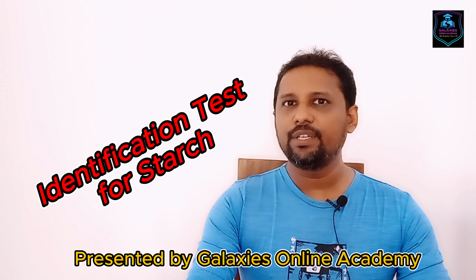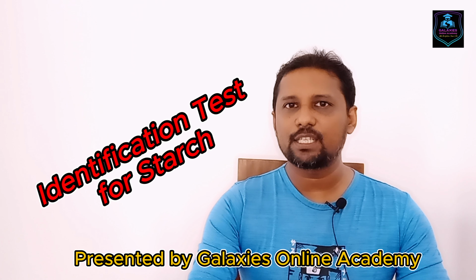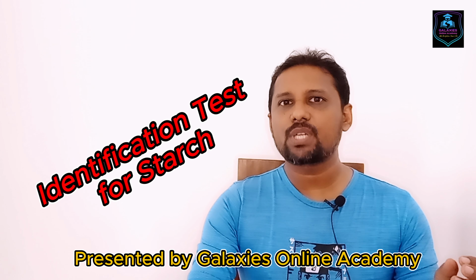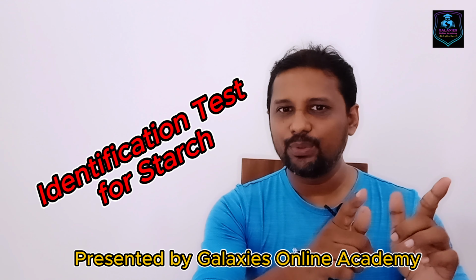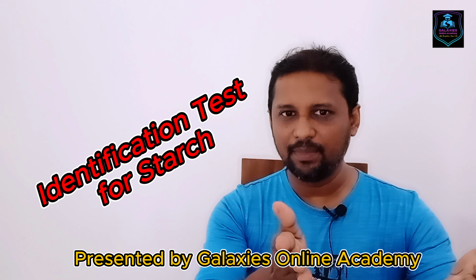Today we are going to discuss a science experiment. This experiment is to identify the starch. This is the starch test. Okay, let's go to our science lab to do this experiment.